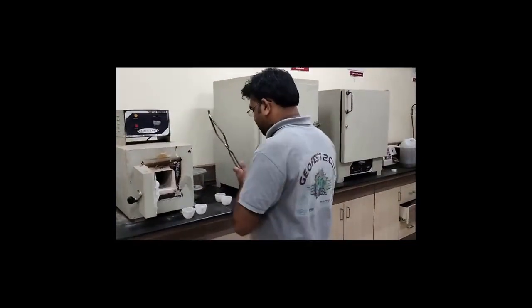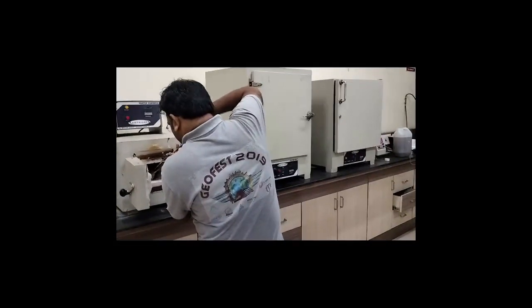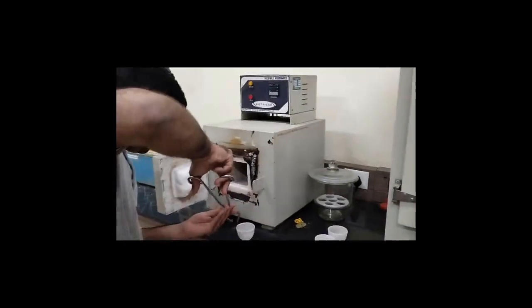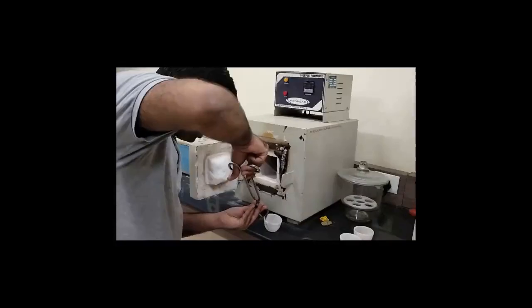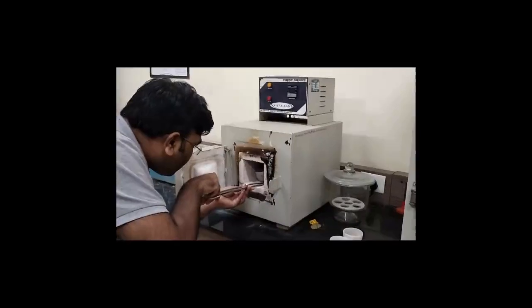It is a bit hot, so I am going to place it with the help of the tongs. At the back side we have kept crucible D, and this is our C crucible. Both the crucibles we have kept properly.